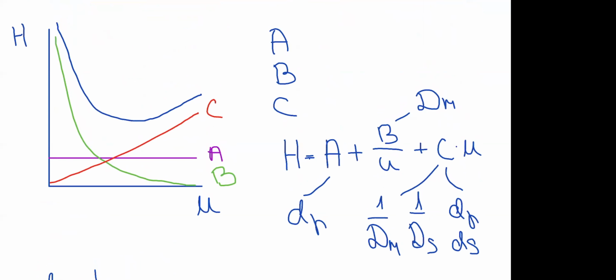Now, one more thing that we could see here is how to choose at which mobile phase flow rate we would actually want to do the measurements. You could think about it for a second.